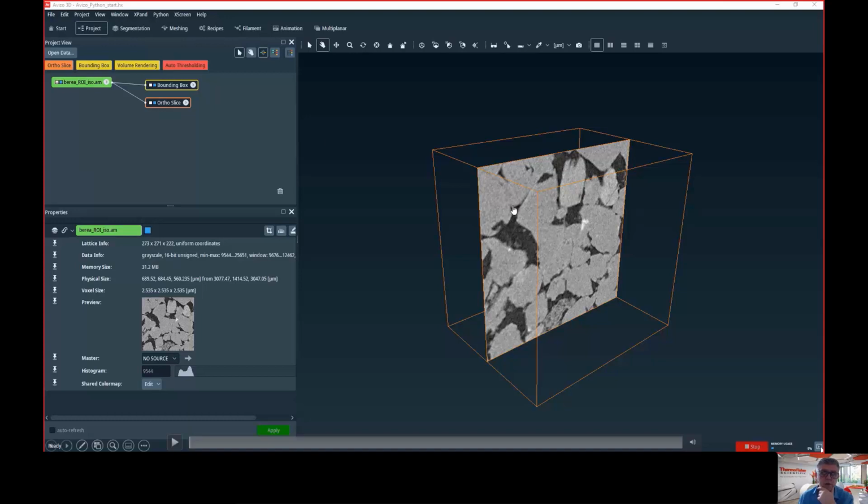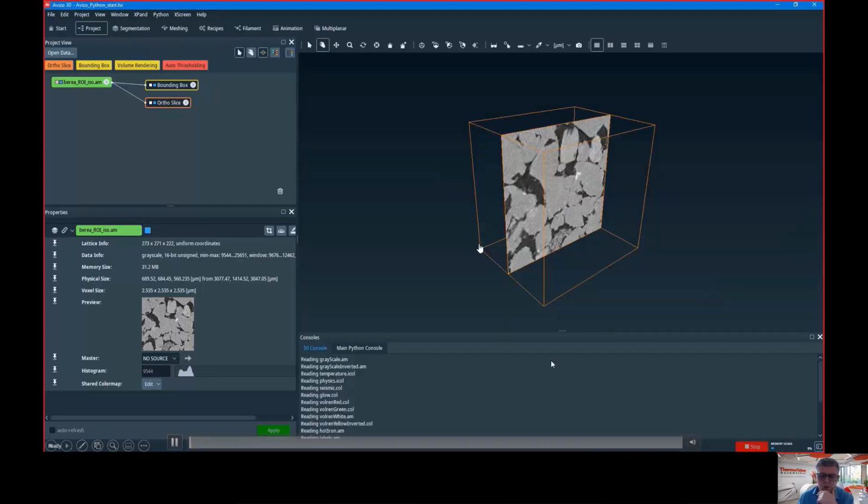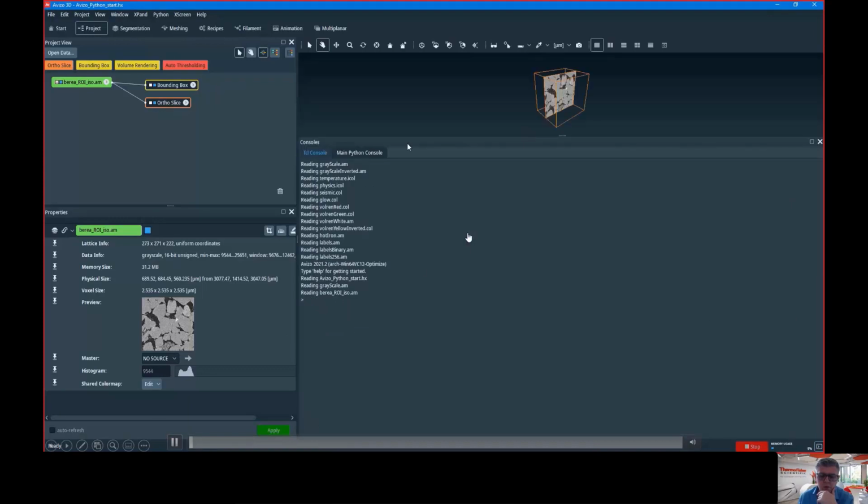Other people just do image filtering. So you start from a grayscale, you output a grayscale. But the segmentation one is pretty common. So I try to go there. But at the beginning, you want to understand, to experiment. So what you do, you go to the Python console.